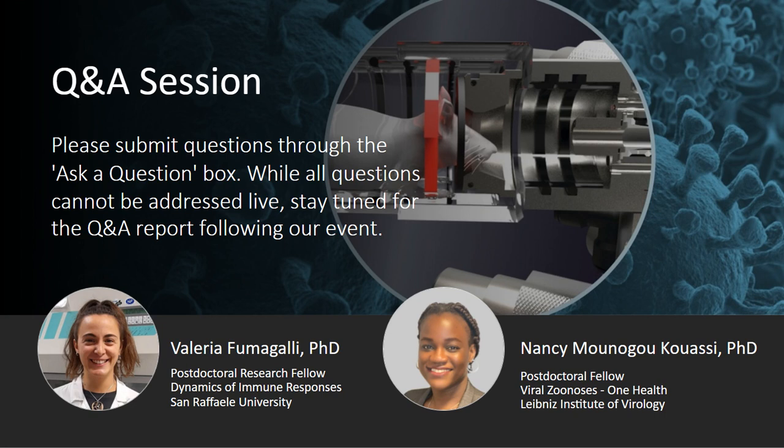It's not possible to do it with the indirect method, but it would be great maybe to have a smaller experiment with just a few animals and perform endpoint measurements, for example, of resistance and compliance. For example, prior to the infection, day 6, and maybe day 14 after infection. It would be nice to have, but yeah, it's an animal application to have also. But yeah, it would be nice to have.